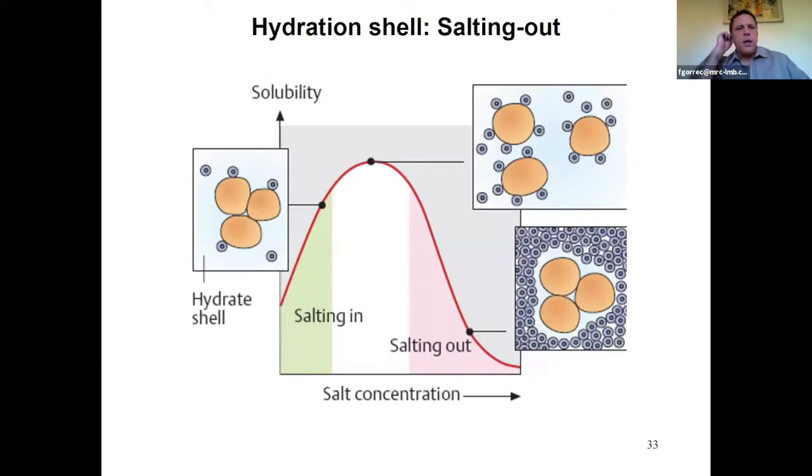In the background, the precipitants have different modes of action and different properties, but if you look at a simple property, the salting out: with the increase of salt concentration, the hydration of the protein will decrease, and the hydrophobic interaction will be favored, and the sample will preferably bind to itself rather than to the water molecules.